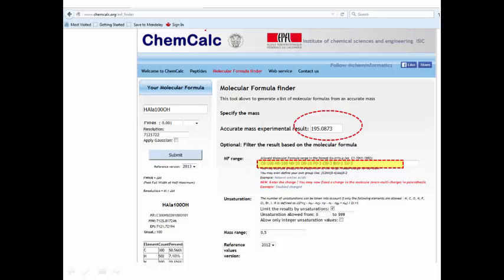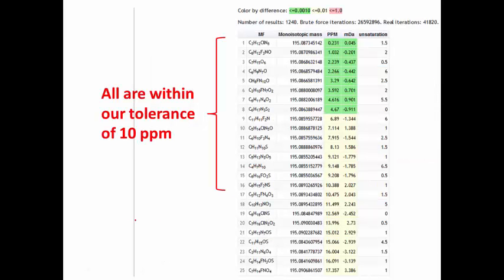So right now in calculating, it's going to give us every compound that has a mass within plus or minus 0.5 of the mass that we've typed in. And it's an extremely long list, so 1,240 different formulas would correspond to a mass of 195 plus or minus a half.